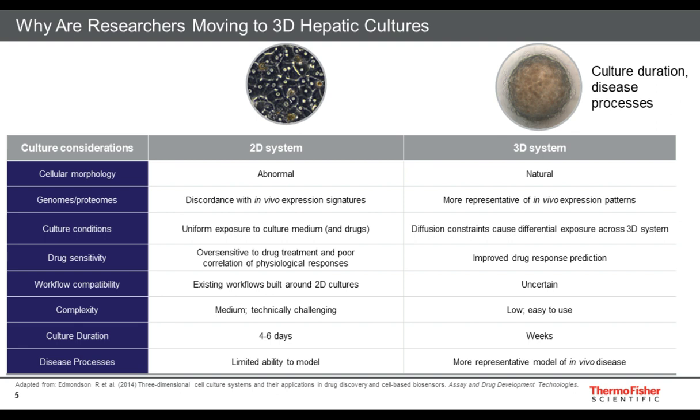Some of the other benefits, again, from a biological standpoint: the longer culture windows enable the study of low turnover compounds, the ability to recapitulate more complex pathophysiological disease type processes, and co-cultures become attractive.